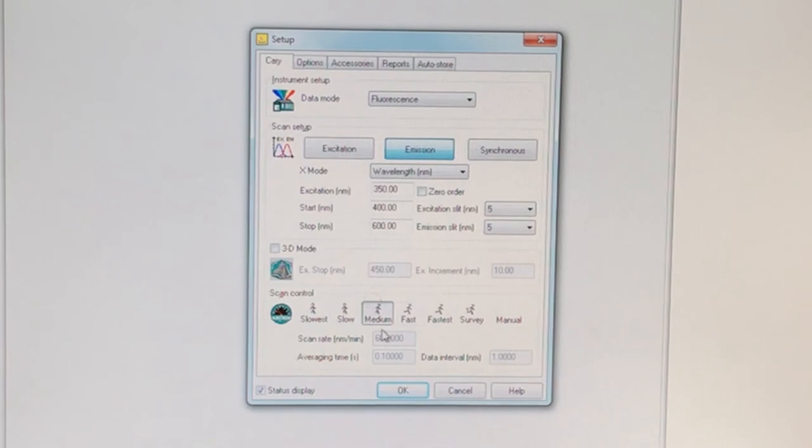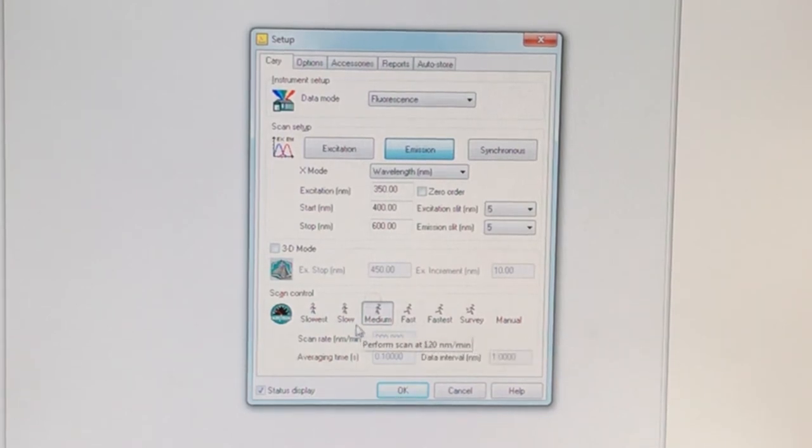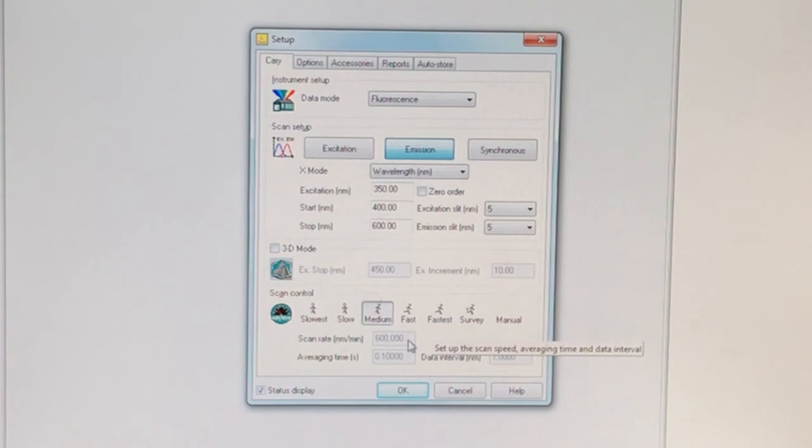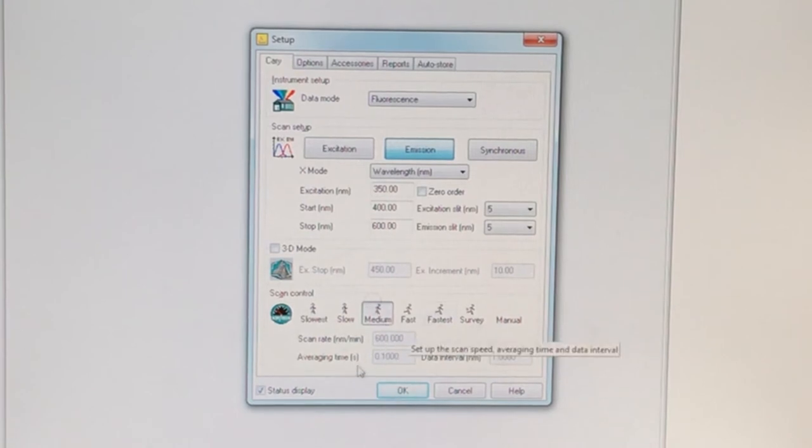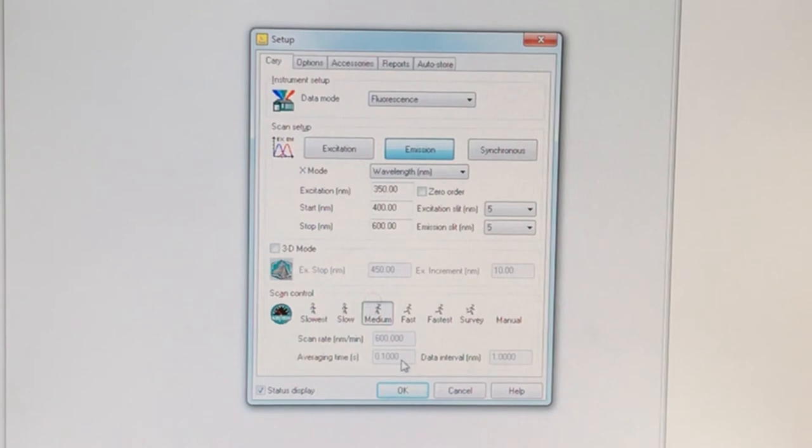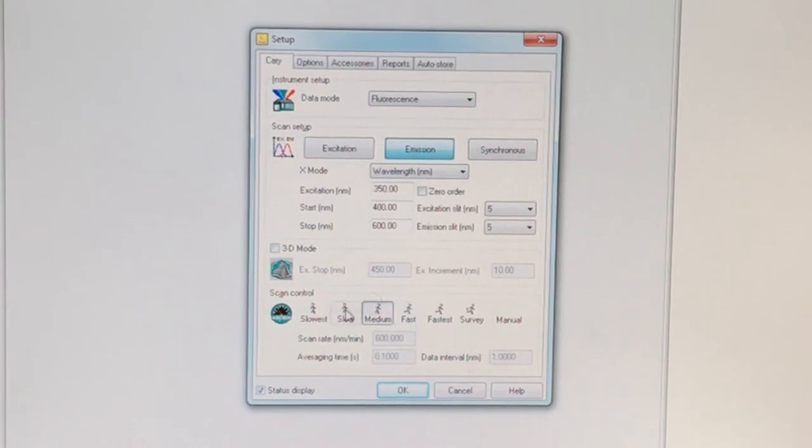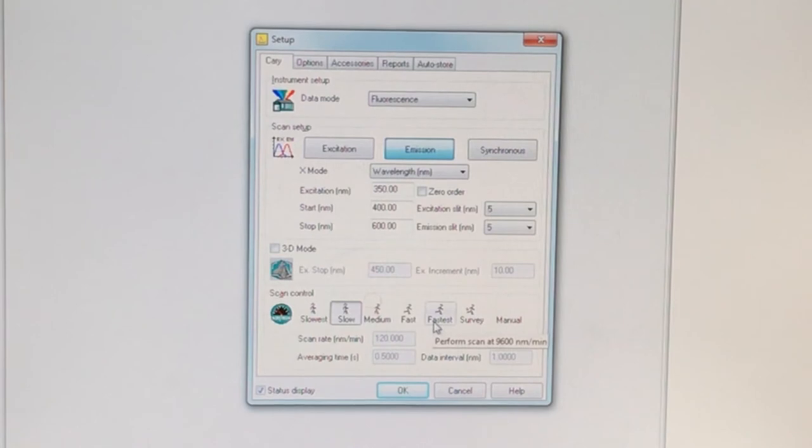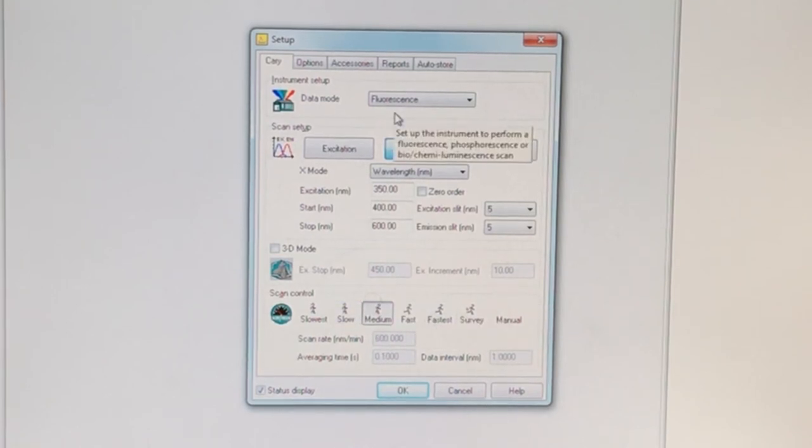The scan control. This is how fast the data are collected. It's a scan rate in nanometers per minute. Right now we're at a medium with an averaging time at each wavelength of 0.1 seconds. Fast goes 1200 nanometers per minute. Slow is 120 nanometers per minute. Medium is typical, but it depends on the type of data that you're needing.